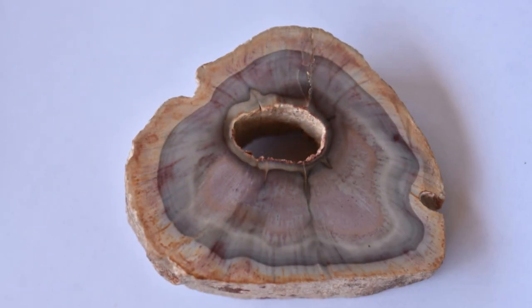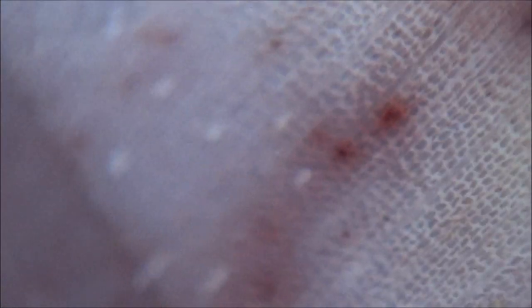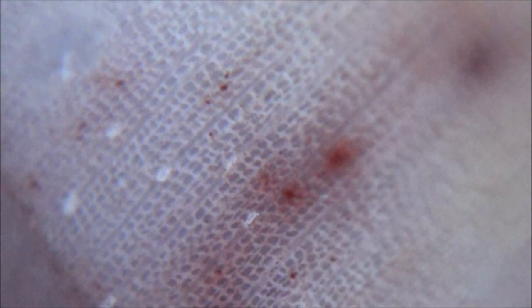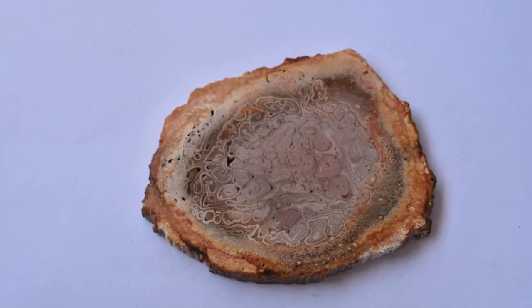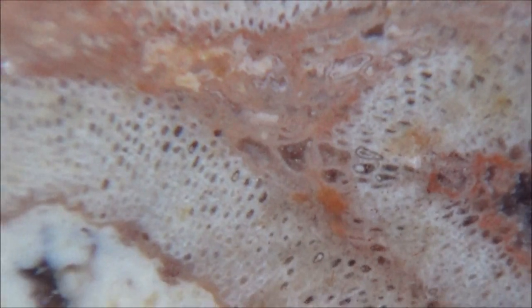Next are a few more plant fossils. A cross section of a horse tail stem. Nice, colorful fossil from Razo, Argentina. A tree fern. Spectacular preservation for a 280 million year old fossil.